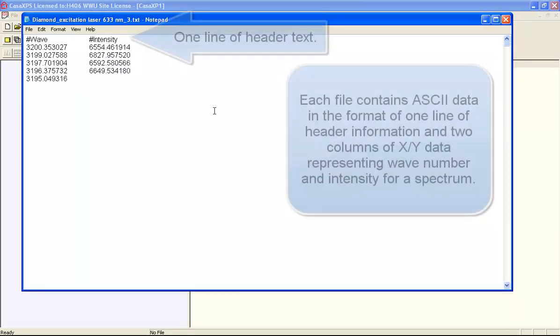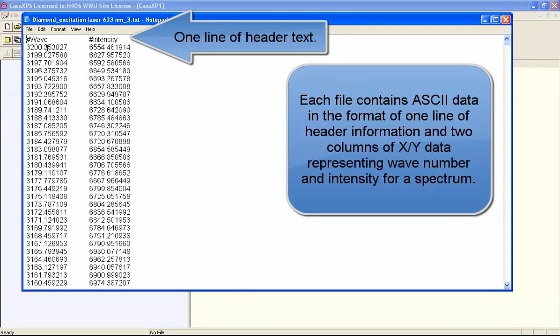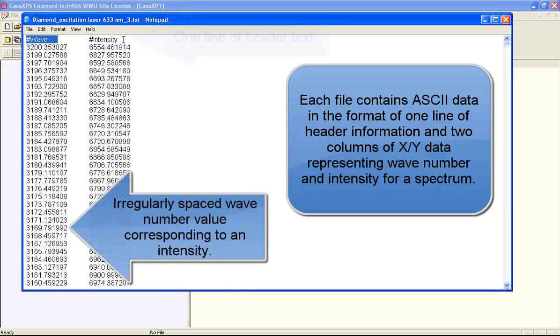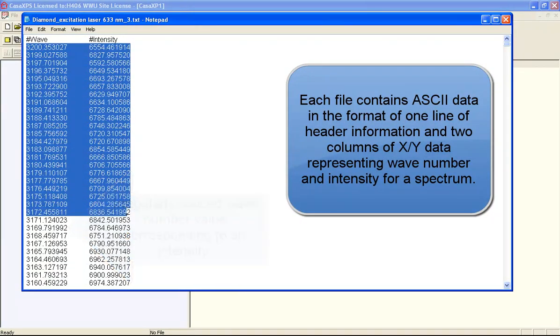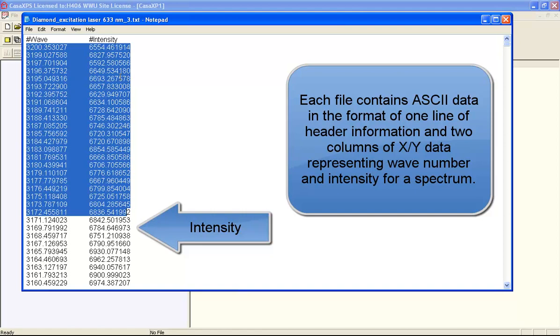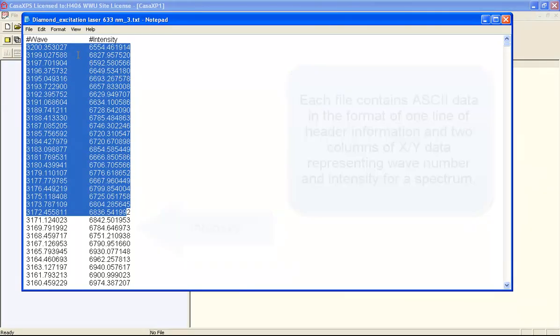So if I look at what this format is, I've got a wavenumber and an intensity, and then I've got two columns of wavenumber and intensity. These are irregularly spaced abscissa, that's to say that the step between each one of these abscissa values are not uniform.